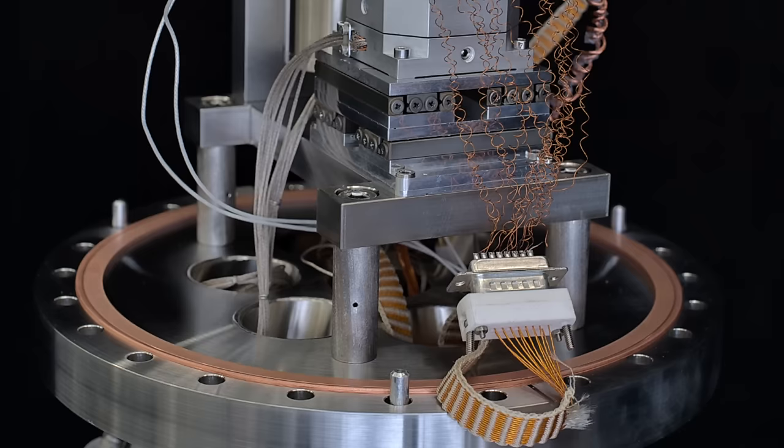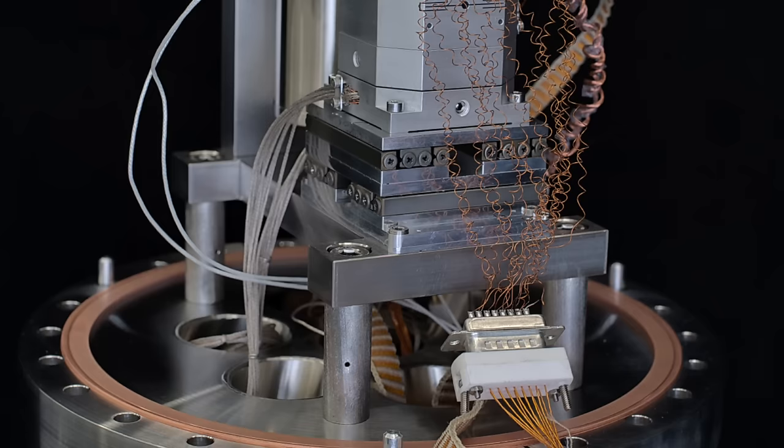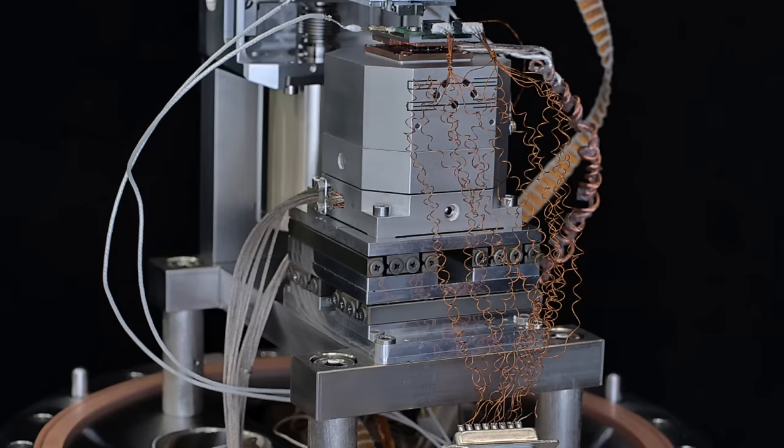Here you can see our scanning thermal microscope, as it looks like when it's outside the vacuum chamber. So down here we have the bottom flange with all the feed-throughs for electrical signals and the optical laser beam.